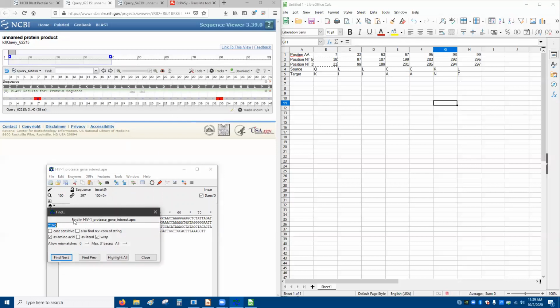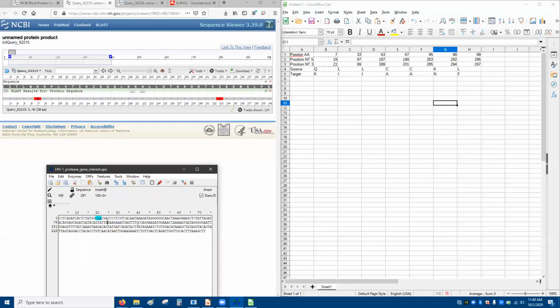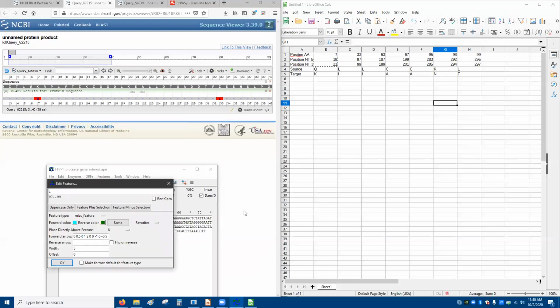We got an L here, so we can do TD, TD, L. Find next. Okay. So these last 3, you want to change to I. Feature, I.